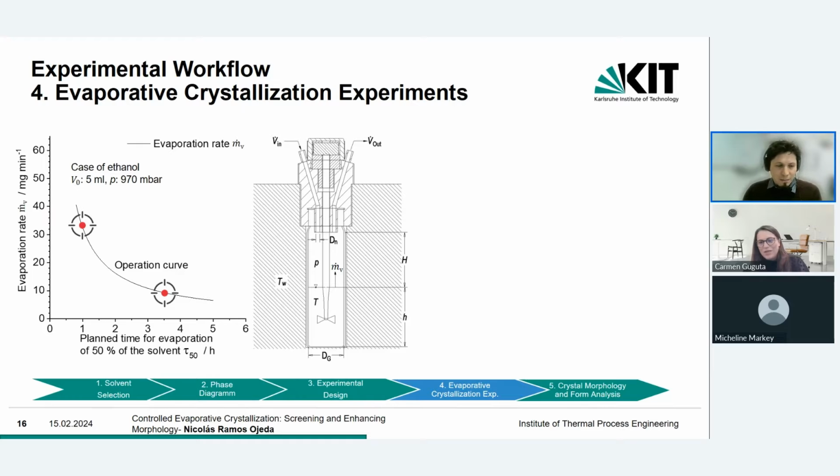Or if it was related to the aspect ratio, maybe it's there. I mean the samples after the crystallization were for sure measured offline. Well, the pictures are taken continuously, but then you analyze them offline. The pictures are taken continuously, normally with an image acquisition rate of 5 seconds, so we get plenty of pictures during the whole experiment.